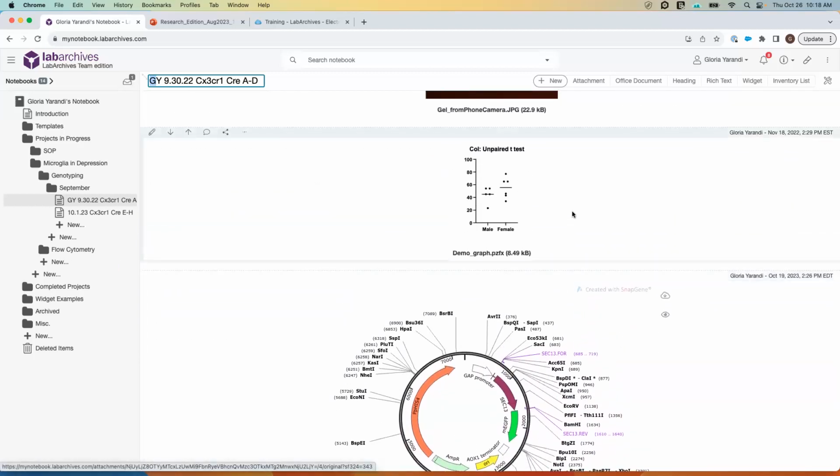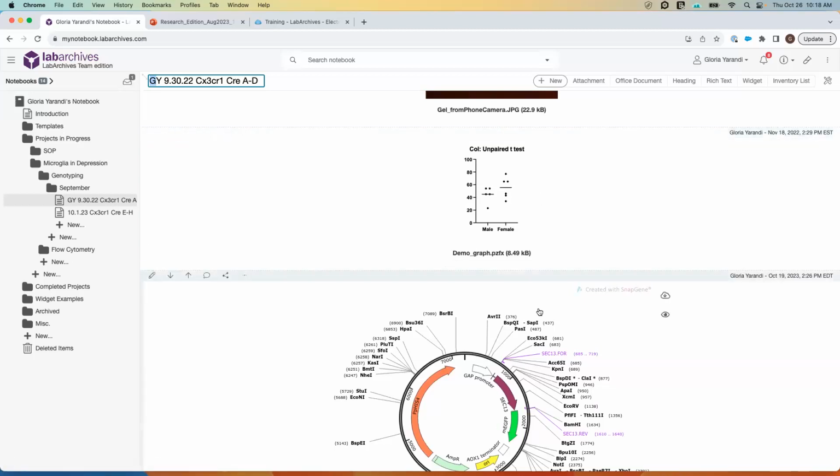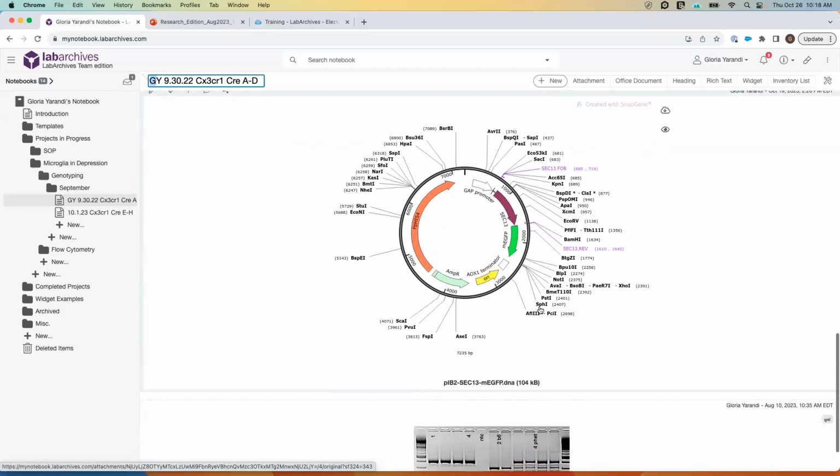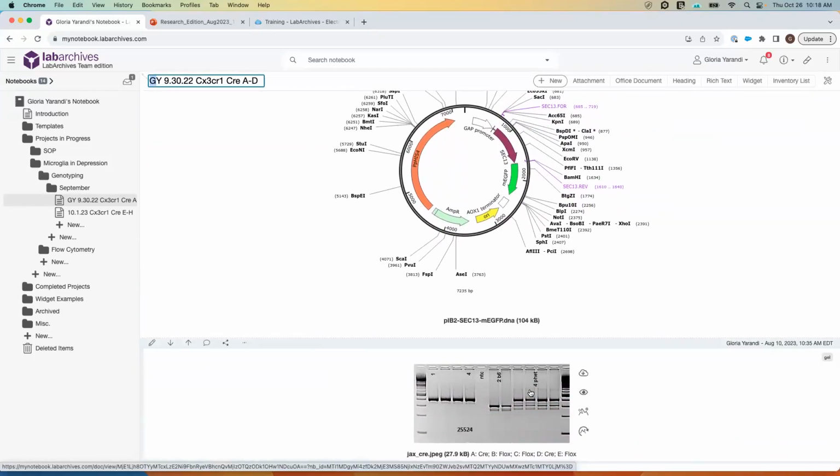As I mentioned earlier, on October 31st we'll go over more about this during our advanced topic session. I was also able to include a JPEG file as well.